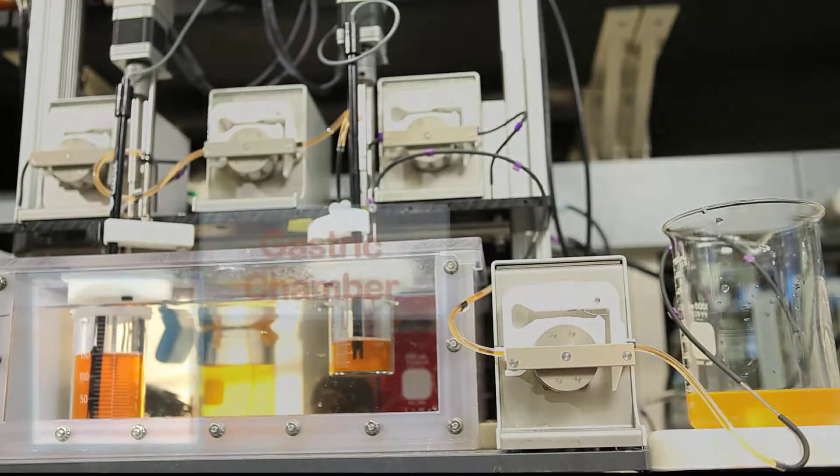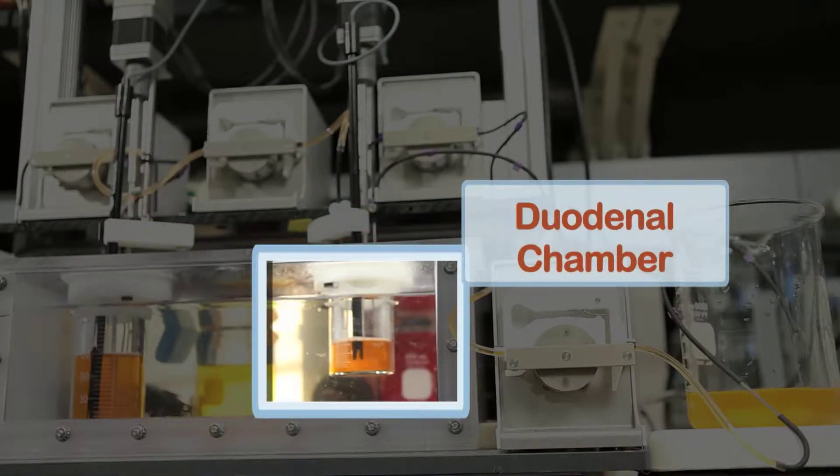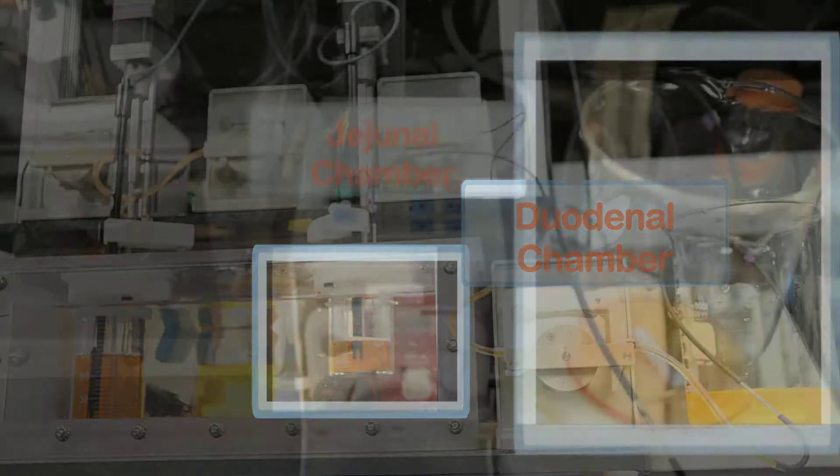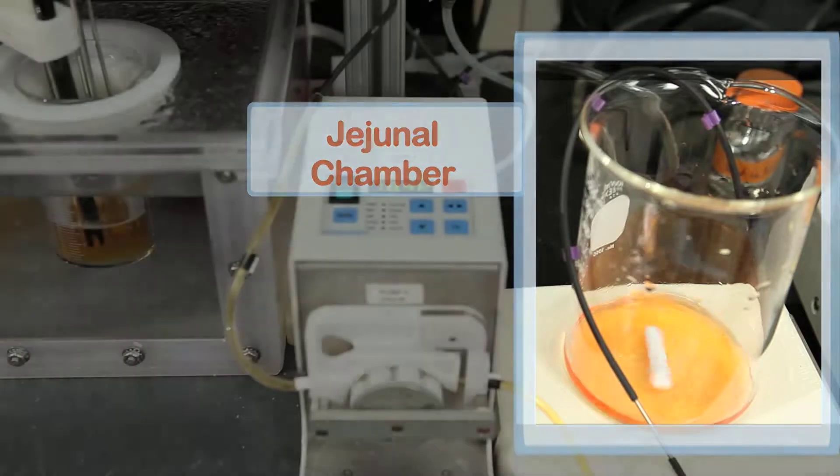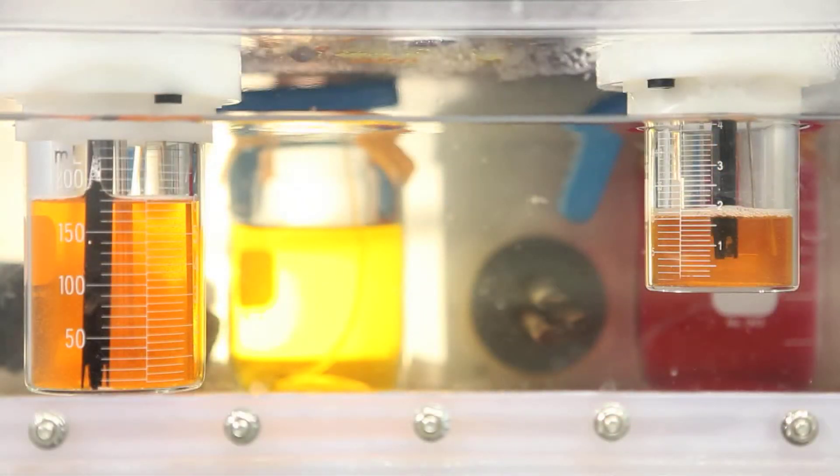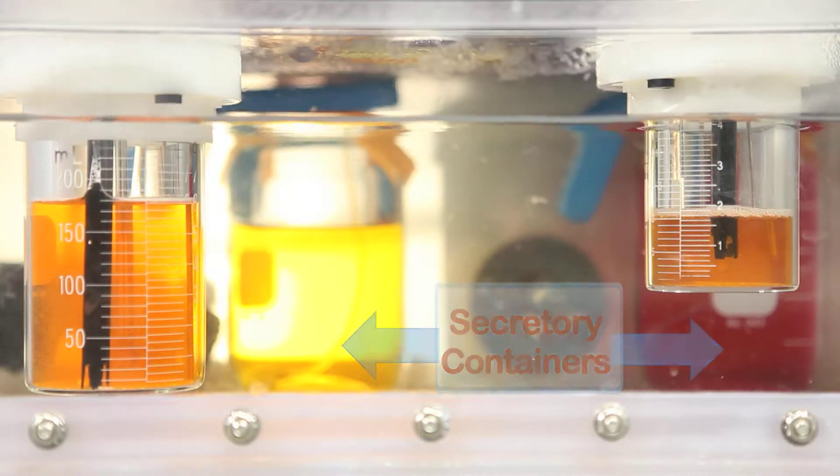The GIS consists of three separate chambers: a gastric chamber to represent the stomach, a duodenal chamber to represent the proximal small intestine, and a jejunal chamber to represent the proximal to mid small intestine. In addition to these three chambers, two additional containers are present to hold secretion fluids that are pumped into the gastric and duodenal chambers during the experiment.